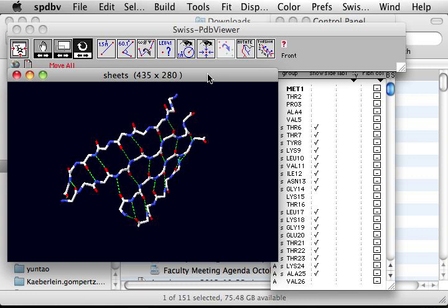So now I'm going to ask you to do an exercise on your own to show only alpha helix. But this time without the beta sheet. But also show the hydrogen bond and then save that as a picture put into a lab report. Okay. Have fun.